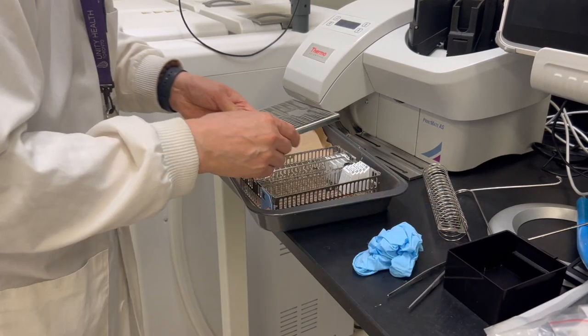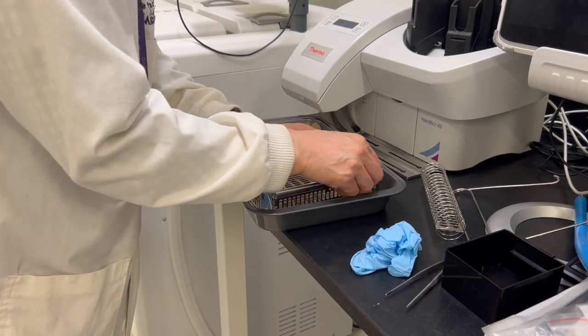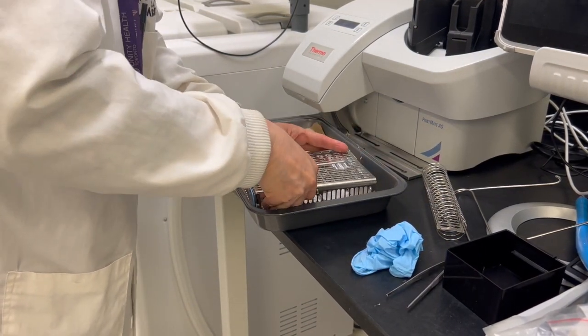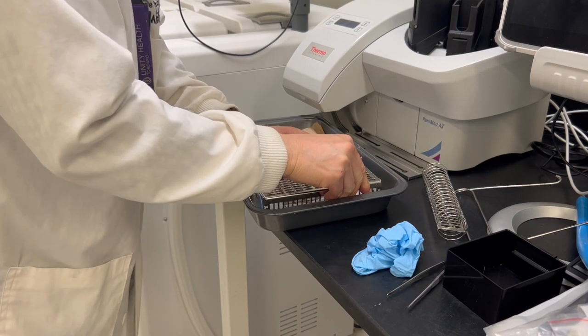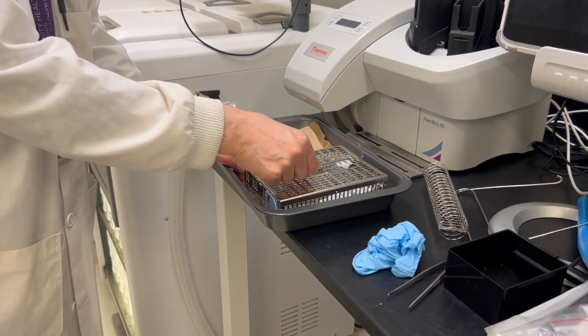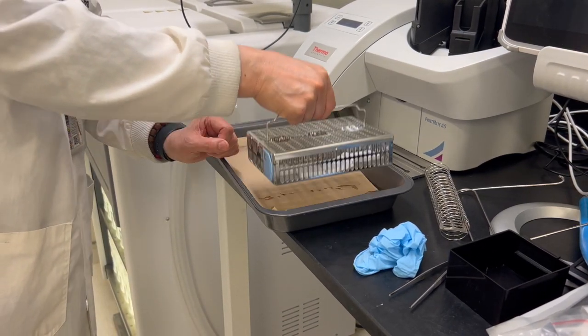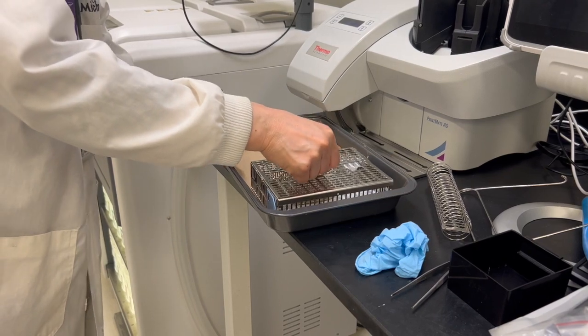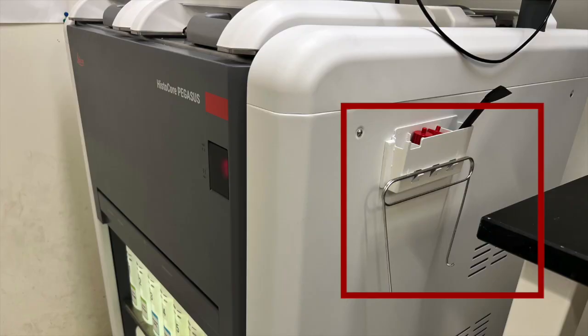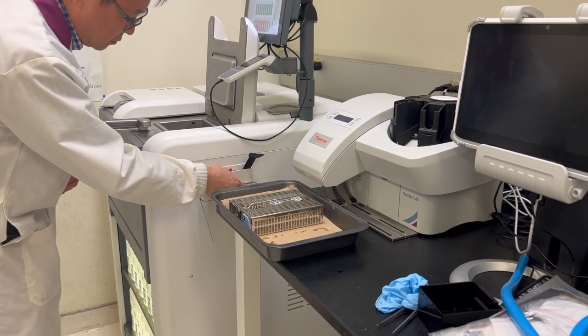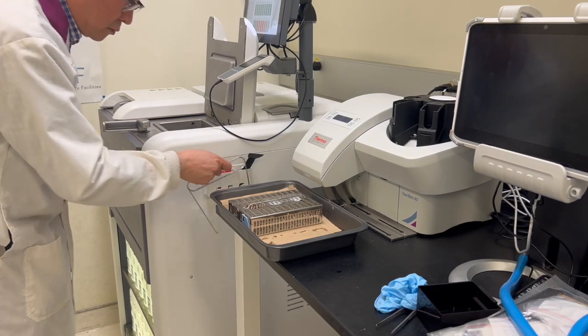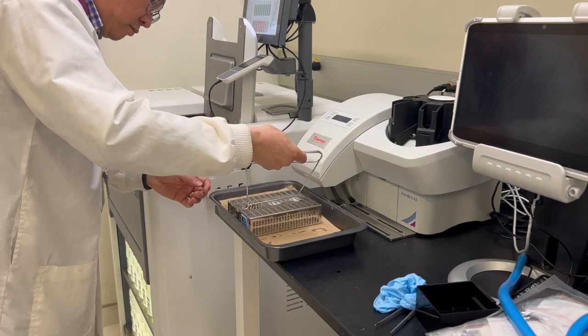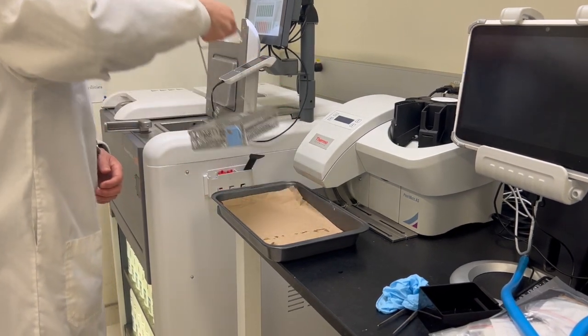After putting your cassettes into the basket, place the basket cover over the cage of the basket. The basket handle is recessed in the middle of the basket and can be extended by lifting it upward. A basket hook can be found on the side of the processor. You can use the hook to transfer the basket in and out of the retort.